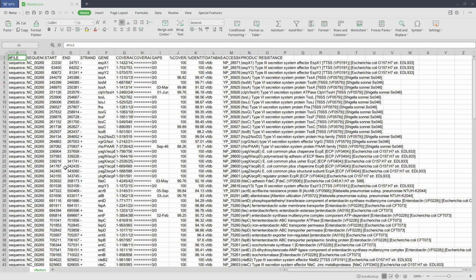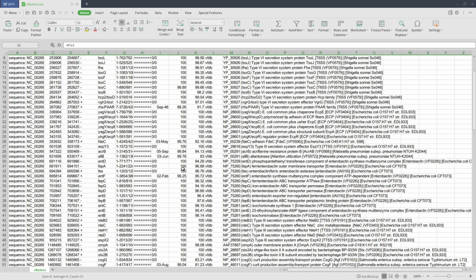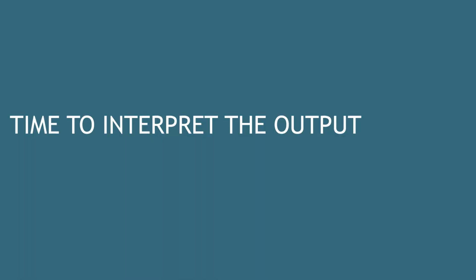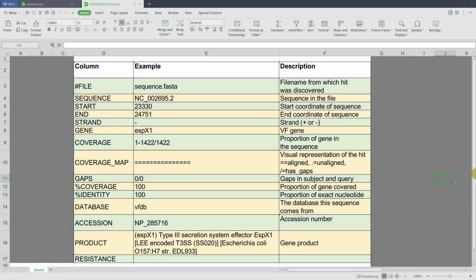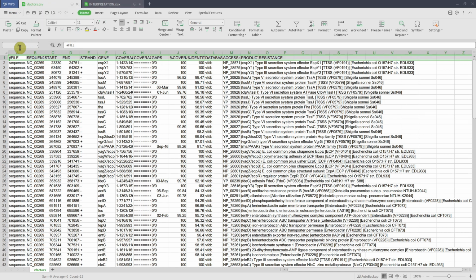So what I will do is use an example to interpret the headers that we have here, because this information is very important. Let me switch over to an extract from this result and interpret it from there. So this is an extract from the results, and we have this information here. You have the headers, which are the ones that I'm highlighting.